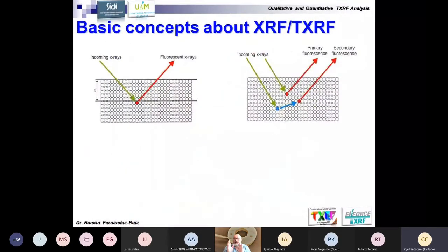More things. The question of the matrix. If we do not have very many atoms in the travel of the photons from our X-ray tube to our sample, and from the sample atom to the detector, a linearity appears between the number of atoms and the photons obtained.